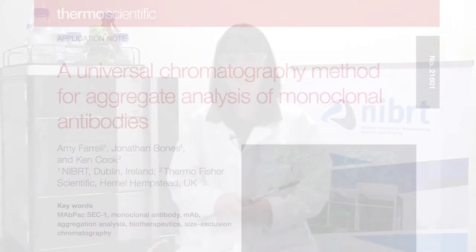Hello and welcome to this application note video demonstrating a universal chromatography method for aggregate analysis of monoclonal antibodies.